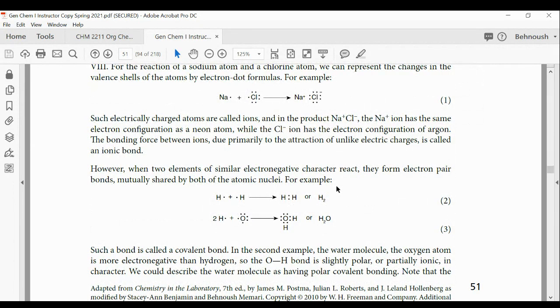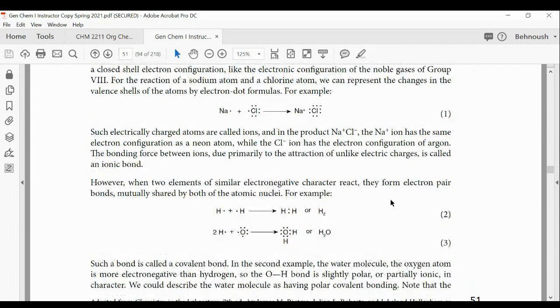So it explains within the experiment, and then it brings a question in the pre-lab, trying to take your attention back to what you saw before, that charges are moving. Okay, charges are moving within the mobile phase. There must be ions and there must be a mobile phase. Those are the two conditions, right? And your ions should be mobile in order to be a conductor of electricity.